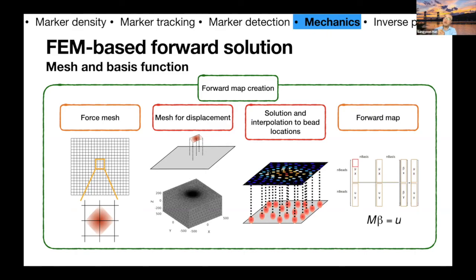But if you enter the displacement as an input, then such a deconvolution effect we probably cannot solve. That was the main thing. But maybe I have limited knowledge, so it's probably worth trying a shot to see what happens. That's a very good comment, I think.